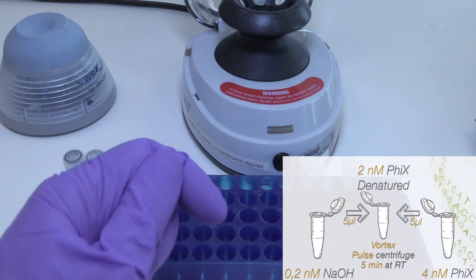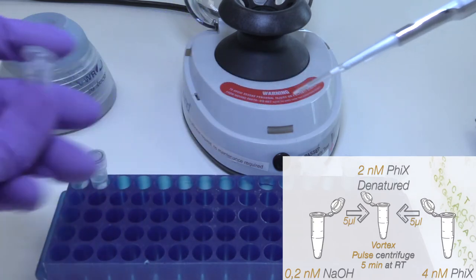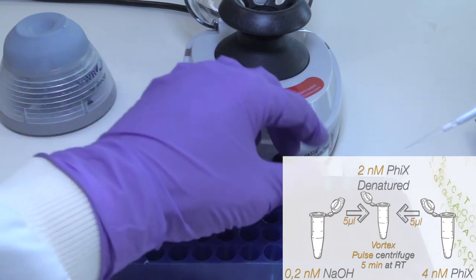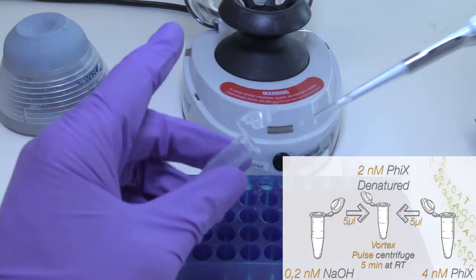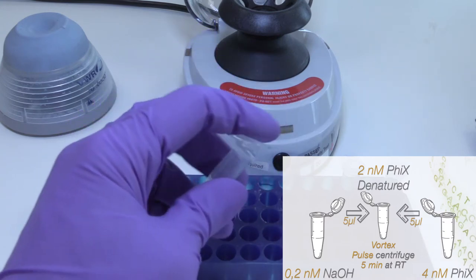Next up, denaturing the Phi-X. Combine the following volumes in a microcentrifuge tube: 5 microliters of 4 nanomolar Phi-X and 5 microliters of freshly diluted NaOH.